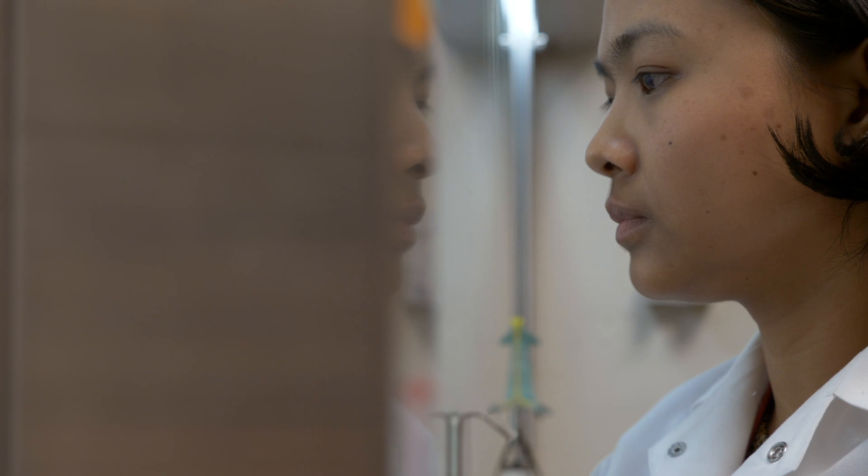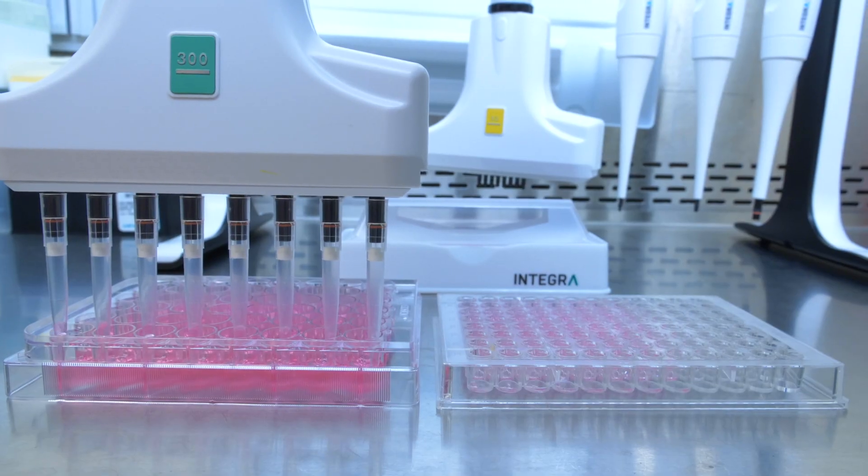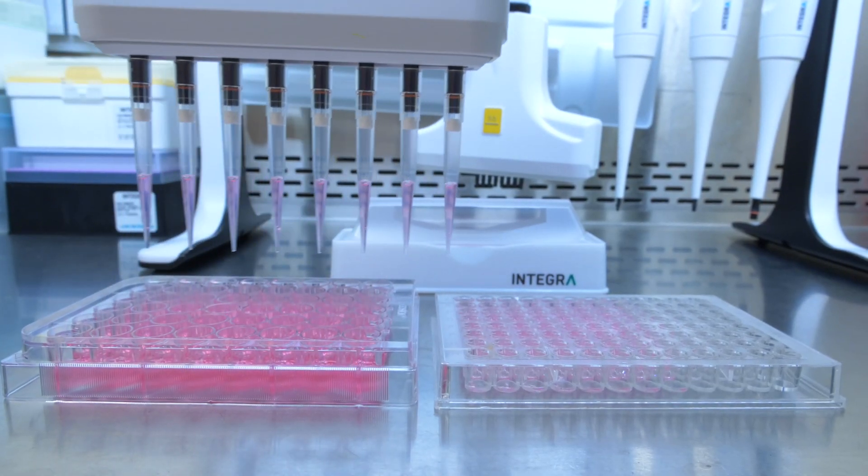The best thing about this Voyager is that it's very easy to use. We can put on the tips and change the spacer according to our needs — for example for 48-well plates or 96-well plates — we can just press the button. It's much faster and can be done one-handed, which was important to us.